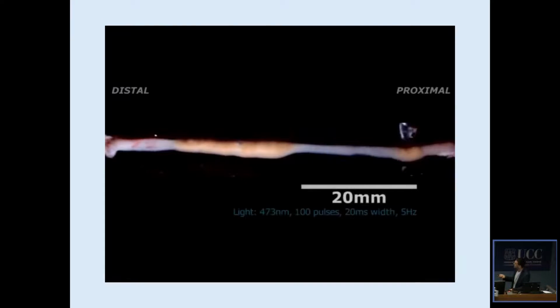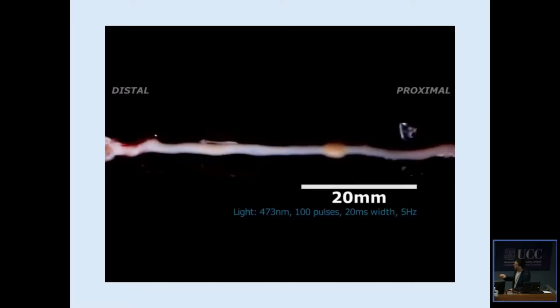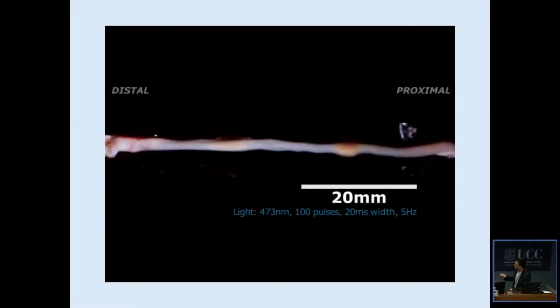This is a mouse from a calretinin expressing animal. Here's blue light delivered to the colon, which triggers a contraction, and the contraction migrates along the gut wall, and we can eject content. If you watch here again closely, right underneath the light source, you'll see the muscle cells contracting directly underneath the light. So this event causes local contraction, and the level of distension and the amount of content in the gut wall will determine how far the motor complex propagates. I think we stimulate it one more time, and you can stimulate all day and the phenomenon won't run down.